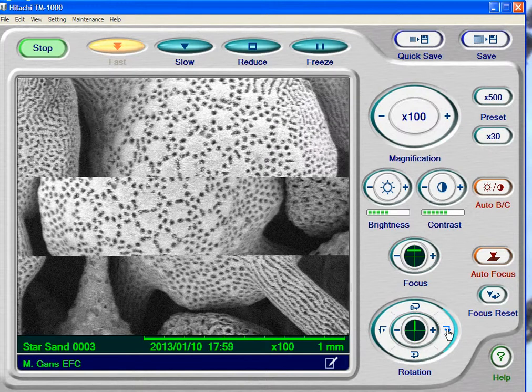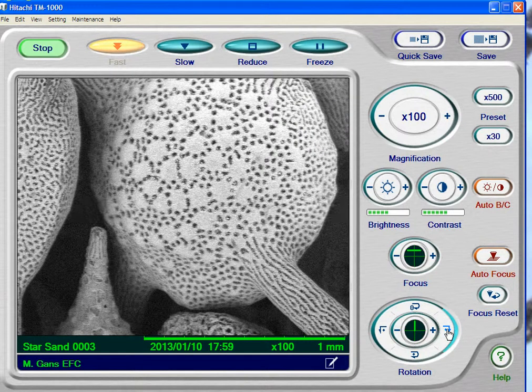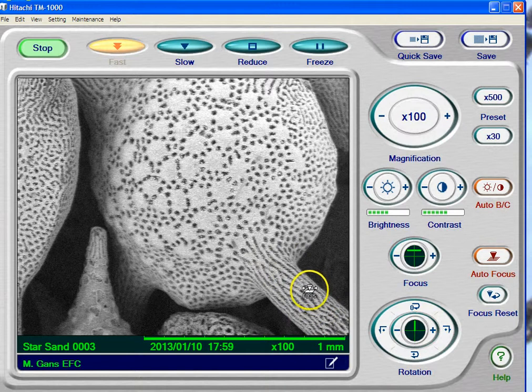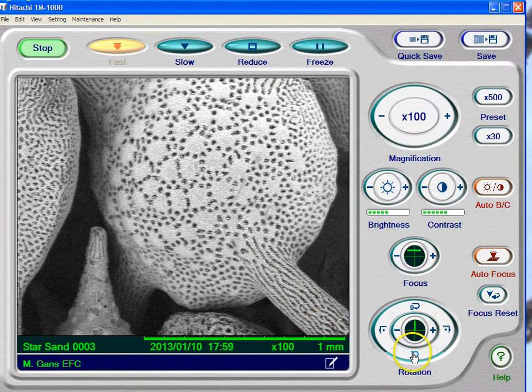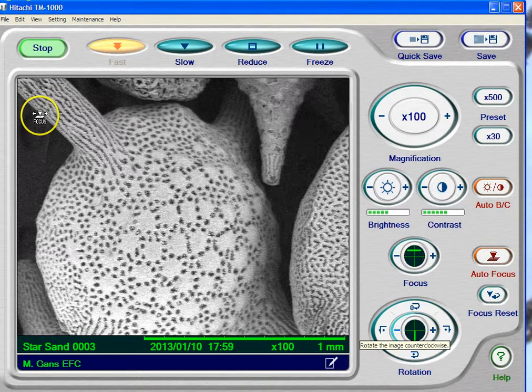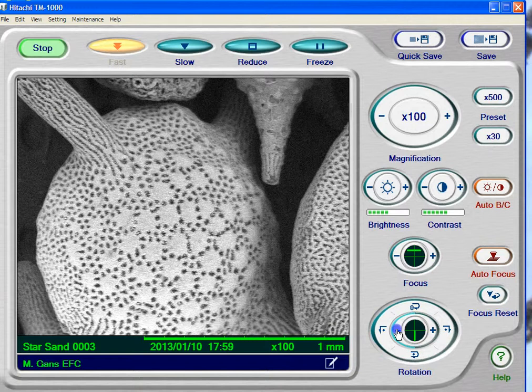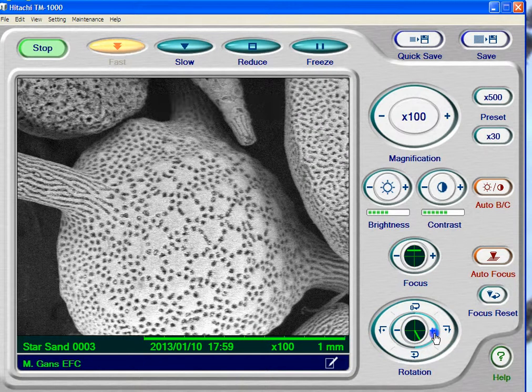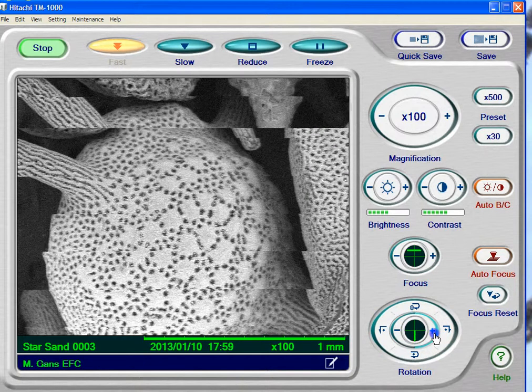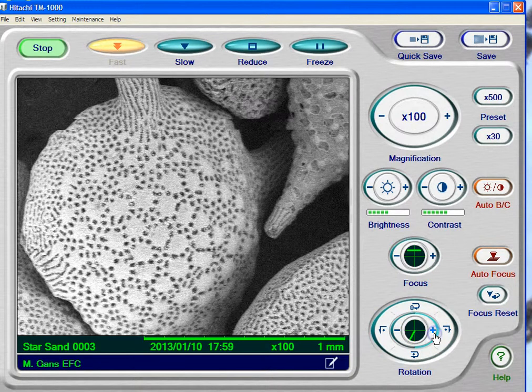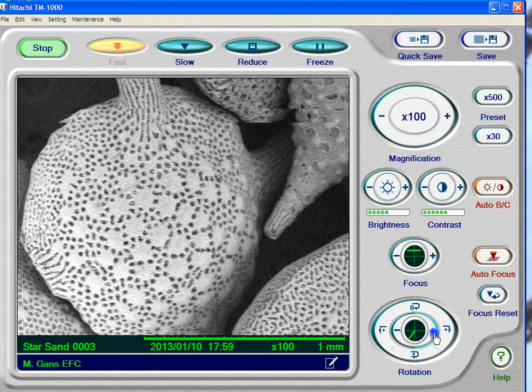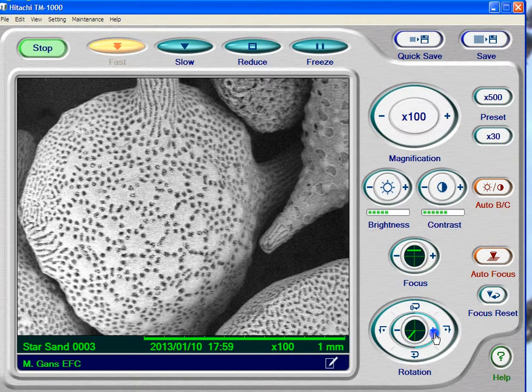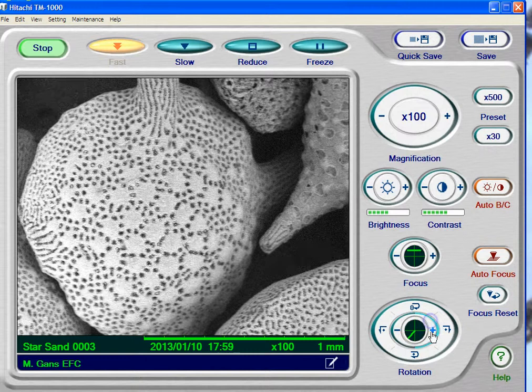Let's say that in this picture I want that particular thing sticking straight up. So I can flip the image — I can click on the little minus or plus here and hold that down, and the picture starts turning. I can start ticking single ticks until I get exactly the orientation that I want, which is pretty cool.